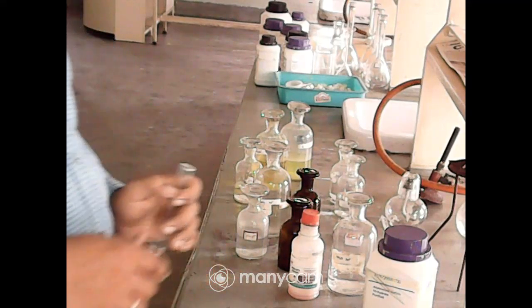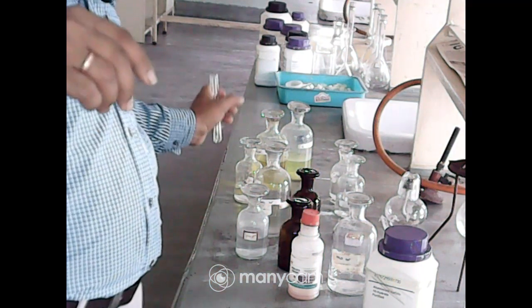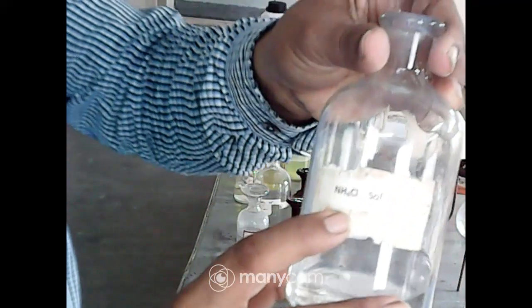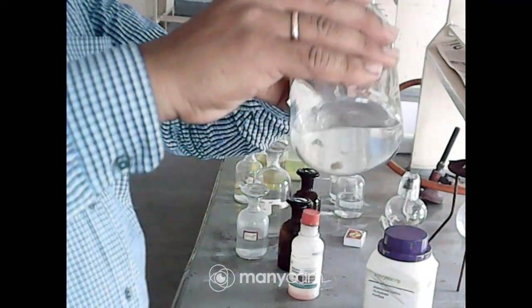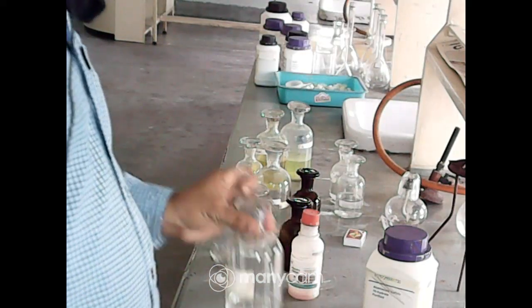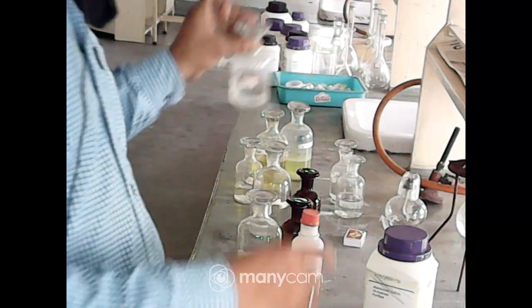Now what is the test? Though you don't know about this, the test is that at first you have to add NH4Cl. You can see this is NH4Cl solution. It will be available on every rack. Added NH4Cl. Now next to that you have to add NH4OH.